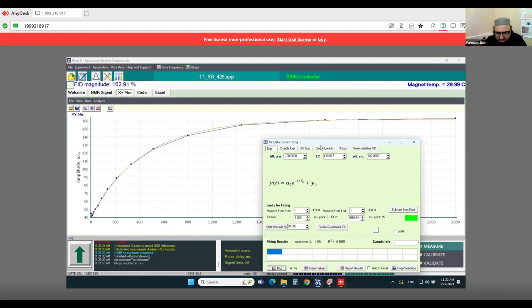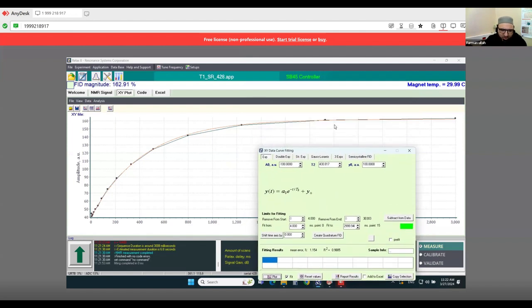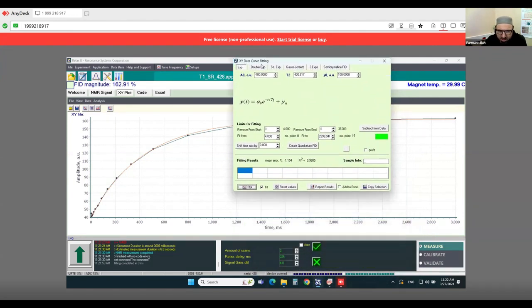So one thing is that you can see the curve with the naked eye. The second thing is that you apply double here, and we have the basic idea. If we divide the amplitude of the slower component by that of the higher, fast component, and in percentage it is less than 10, then it will be mono. If it's greater than 10, then it will be biexponential.